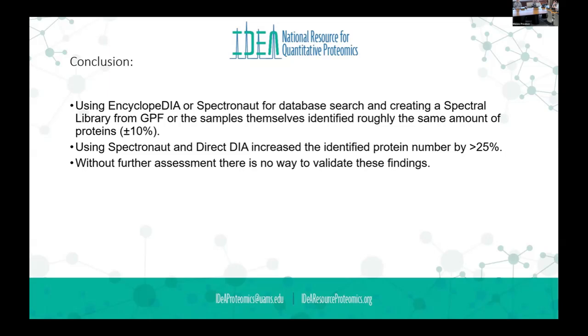And then I found out that if you set automatic for the IDs, that's the MaxLFQ method from MaxQuant. The other one is the quant 2.0. They said that's the top 3 method, but it can't be just top 3 because it's their own version of top 3. So there's a lot behind the scenes that we can't even backtrack. It's also a black box.